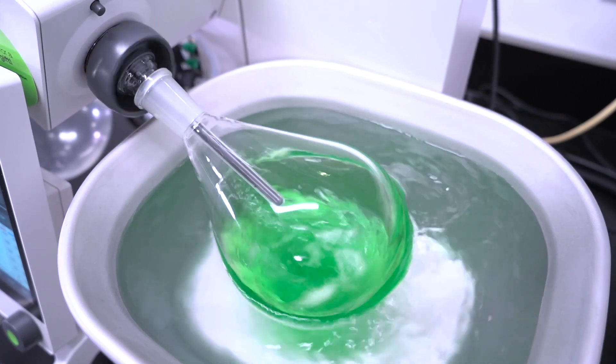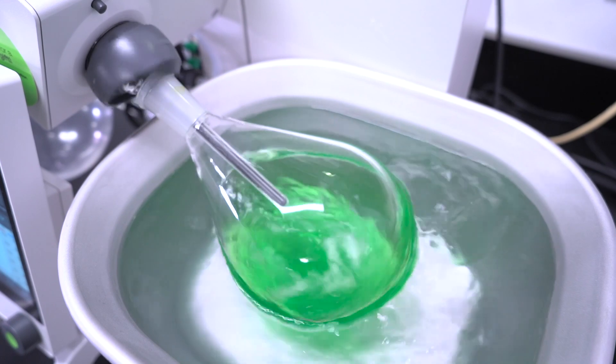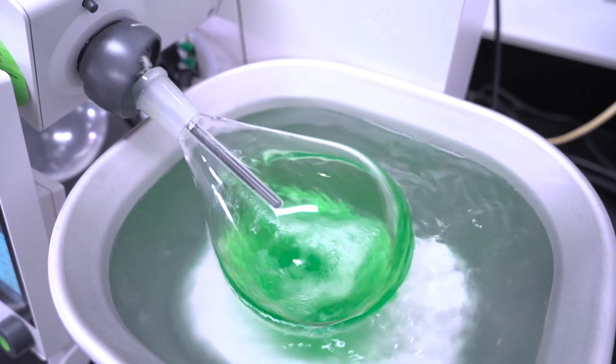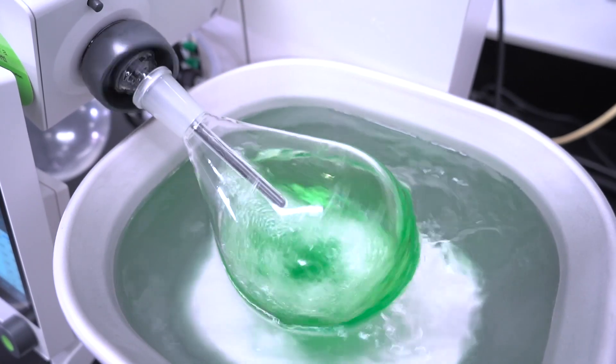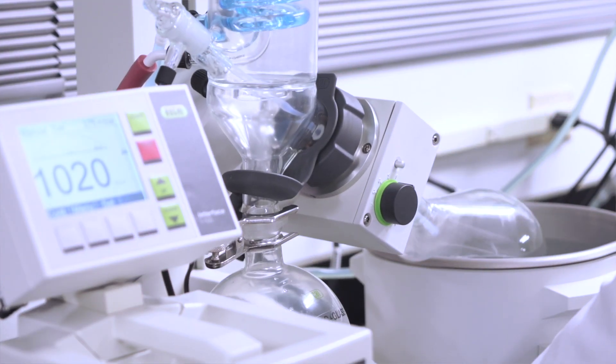The R300 has options for a five-liter water and oil bath that can heat up to 95, 180, or 220 degrees Celsius — provided a suitable heating media is used — or a one-liter water bath which may be set up to 95 degrees Celsius. The R100 has a four-liter water bath which can only be set up to 95 degrees Celsius.